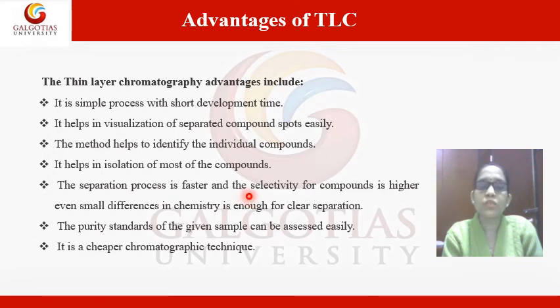The separation process is faster, selectivity for compounds is higher even for small differences, and it is a clean separation. The purity of the given sample can be assessed easily. It is also a cheaper chromatographic technique. So these are the advantages of thin layer chromatography.